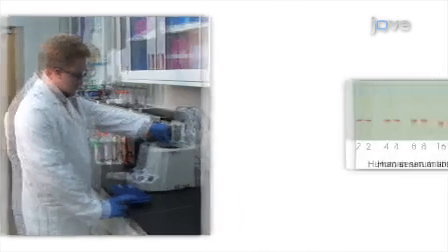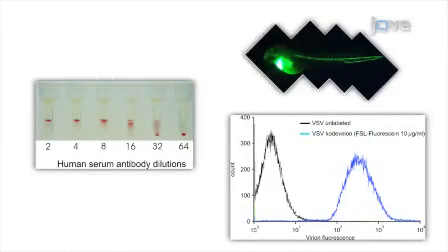experimentally as usual. Ultimately, surface-modified live cells or virions can be visualized through all routine experimental analysis techniques, including flow cytometry, microscopy, and agglutination. The main advantage of this technique over existing methods, like covalent labeling, is that it is rapid, robust, flexible, and does not affect the vitality of the modified cell or virion.